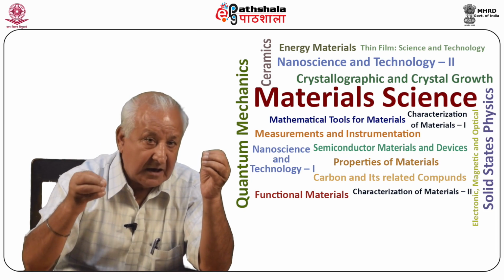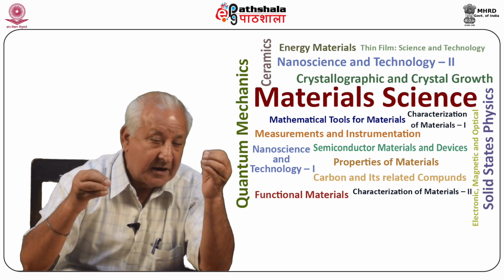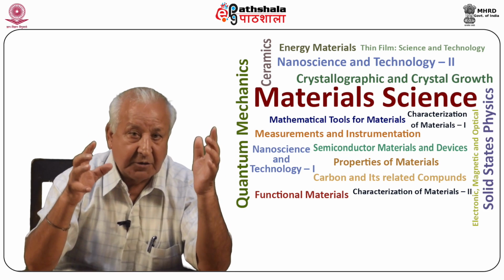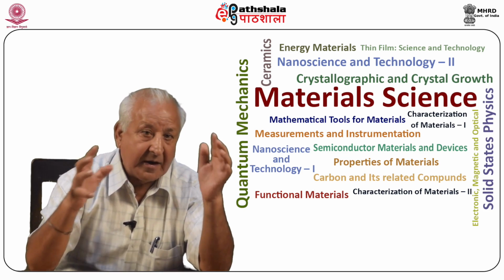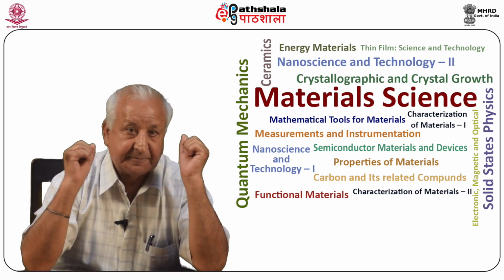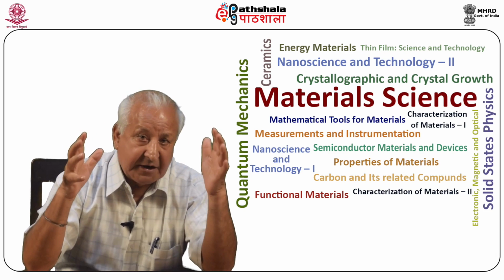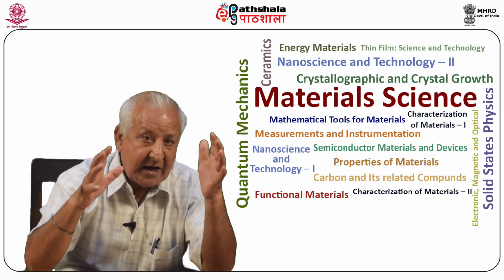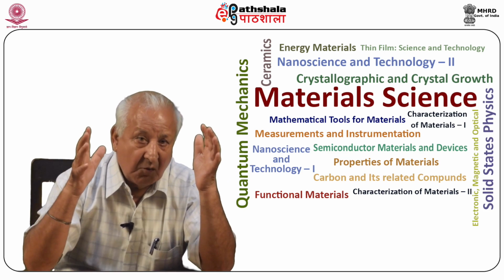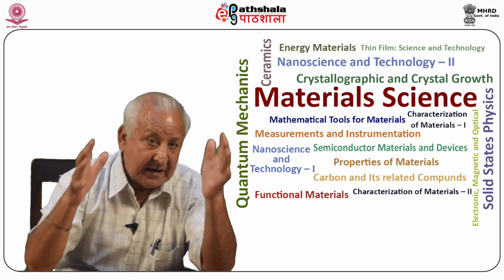The role of the gel is to limit the number of critical size nuclei and decrease the rate of crystal growth, either by controlling the diffusion of reacting ions or by governing the reaction velocity on the surfaces of the growing crystals. The resulting chemical reaction can be expressed as AX plus BY gives AY plus BX, where A and B are cations and X and Y are the anions.